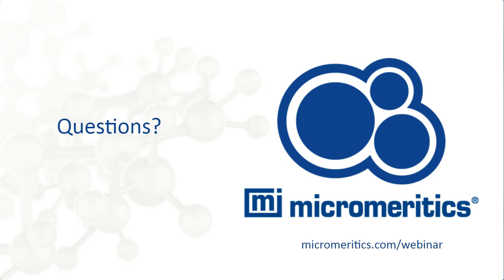Okay. Thank you. And also, you showed this very nice comparison between supported copper oxide and pure copper oxide. The supported copper oxide had a very narrow peak versus the much broader pure copper oxide peak. Is there any influence of particle size on the pure copper oxide versus perhaps a much more controlled finer particle size for the supported copper oxide?